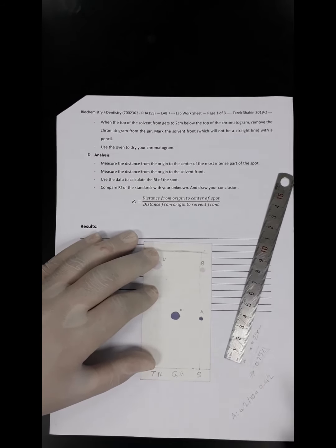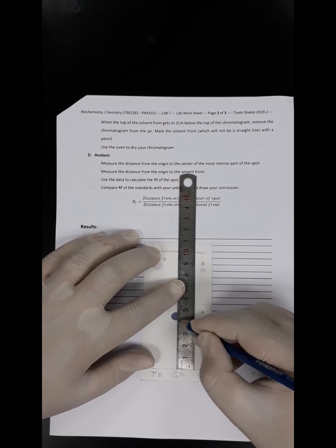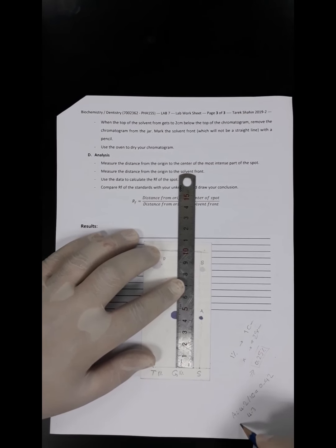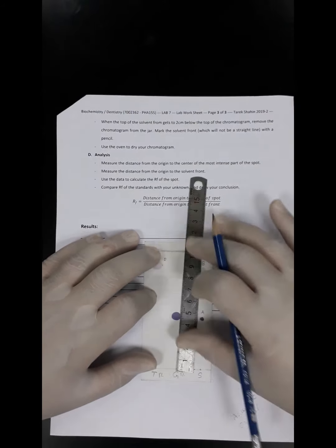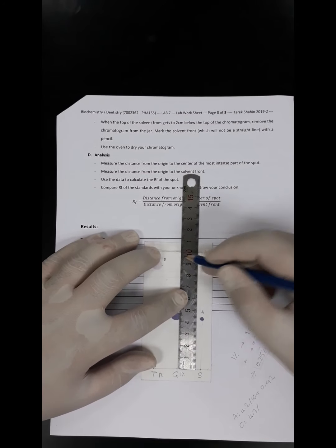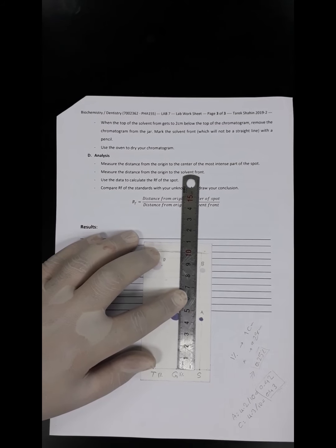Now we are going to calculate it for spot C. This is the center of spot C. Again, we measure from here to there, so it is around 4.2, 4.3. This is for spot C. And we divide it by the solvent front, from here to there, which is again 10 centimeters. So it would be 0.43. Notice that these two readings are very close to each other.